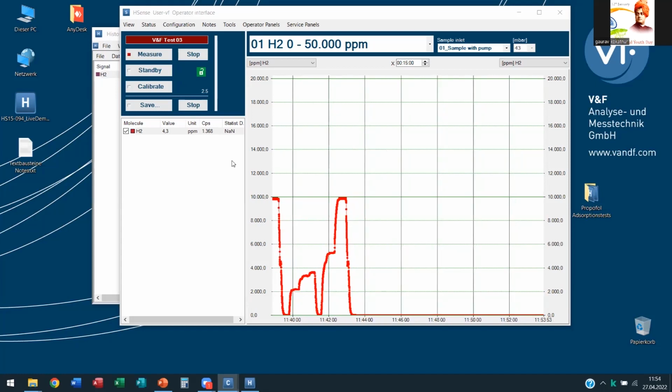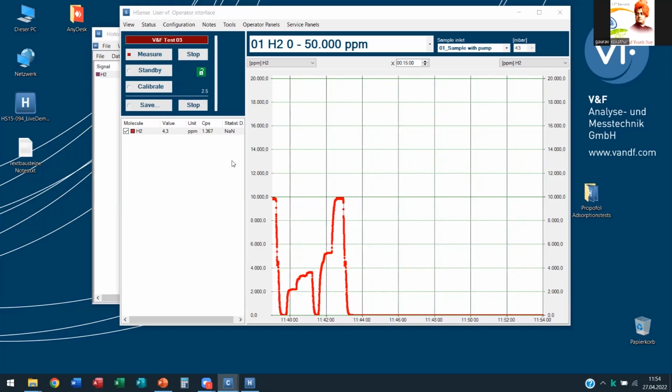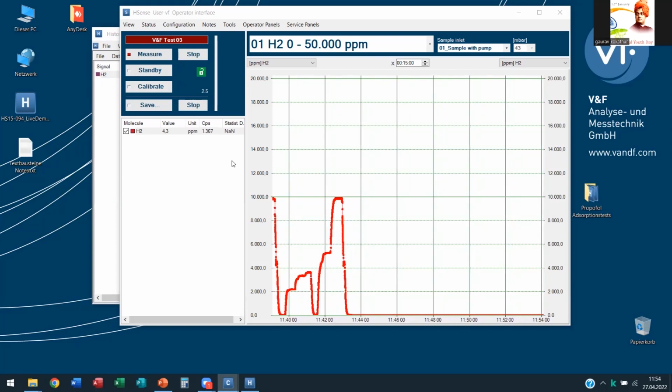Well, one more thing, is there any purging option for this system so that you can clean up frequently? Because we will be continuously testing the system. Maybe after some time we have to clean the complete sampling line. So is there such an option given for purging the system?